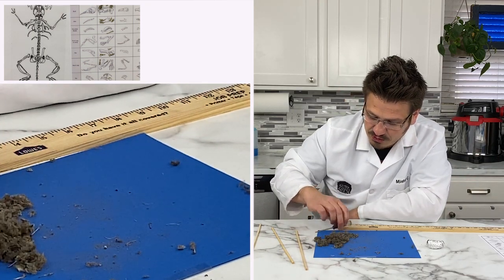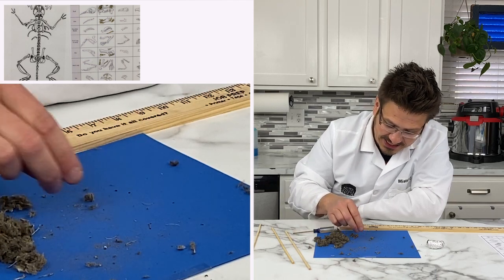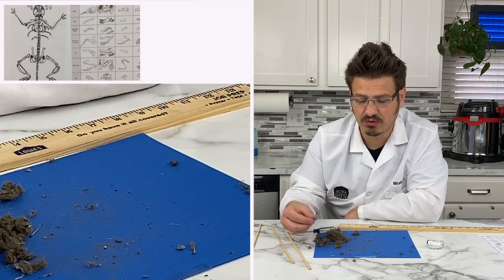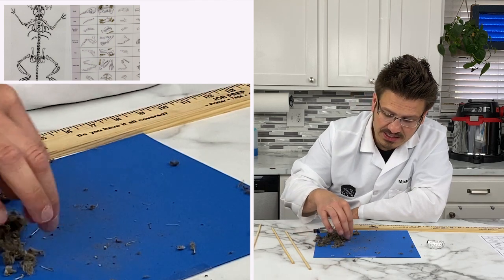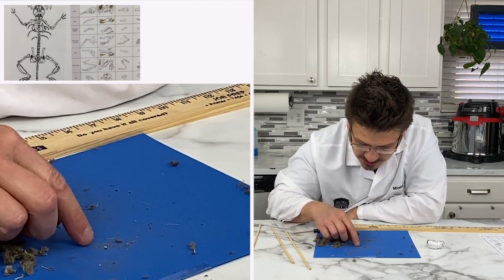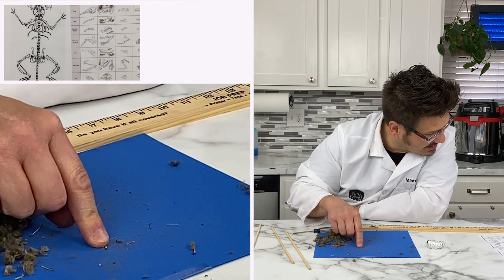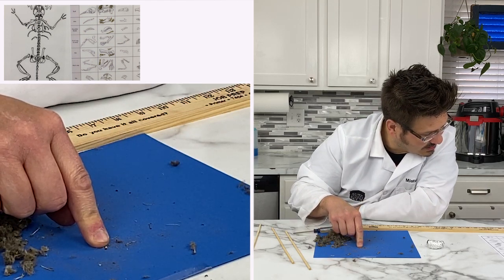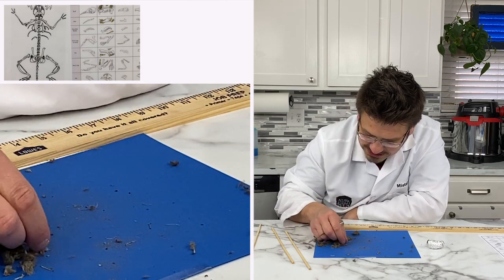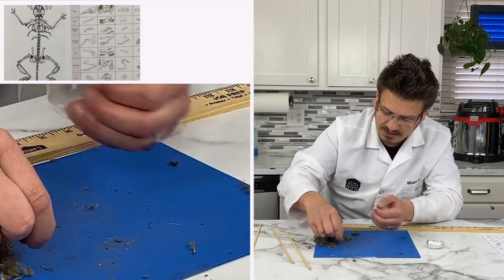All right. So we've gone through our pellet. It looks as if now, obviously I have to go through this much more carefully to get more and more of the bones. There are very small, fine bones in there. I'm going to guess I maybe just came across, I don't know what these are. I think these are the teeth. I've got these little teeny little bones.